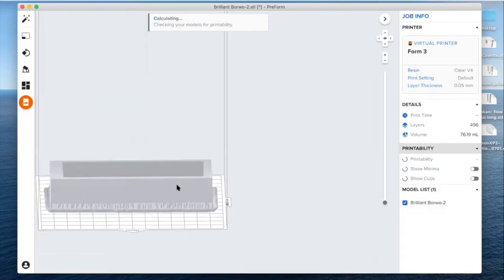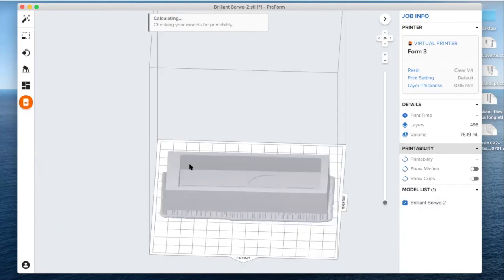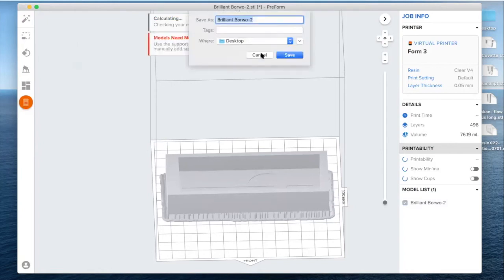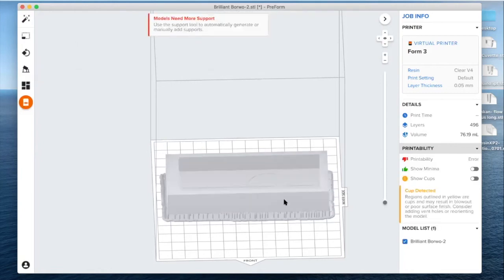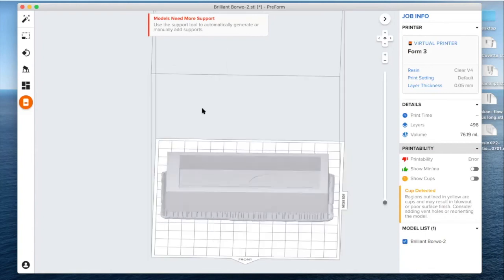All right, that's it. For using this one, either you put it on your computer and you save it, or you do it directly on the computer that is in the printing room. That one is already connected to the printer, because this printer doesn't have a USB stick or SD card. You need the computer to bring the file to the 3D printer's internal memory. So you need the computer attached to the printer. Or Wi-Fi, but we don't have Wi-Fi.